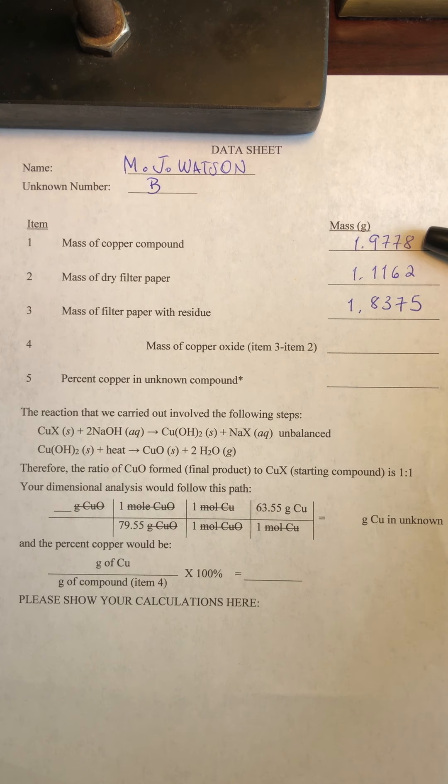Here is the mass of the copper compound. Here is the mass of the dry filter paper. And this is the mass of the filter paper after we have passed the reaction mixture through and dried it. And that's the residue.